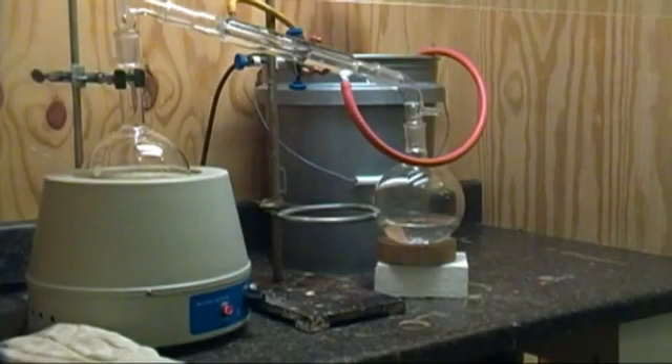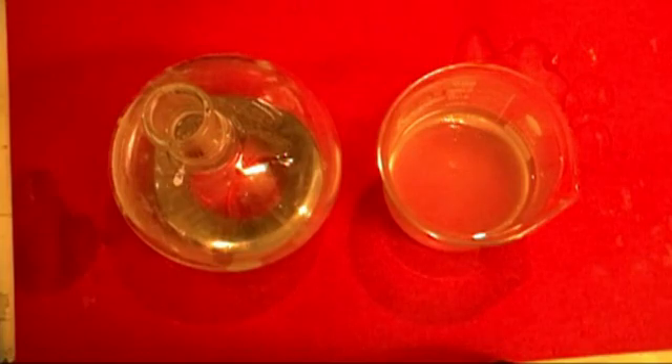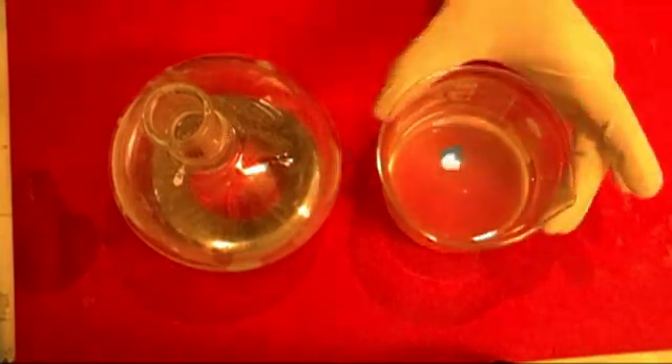After the reflux is done, reset up for distillation and distill the ethanol off. Stop collecting once the temperature reaches 100 degrees C. Now you have your two products separated — here is the sodium acetate in water, and here is the ethanol.